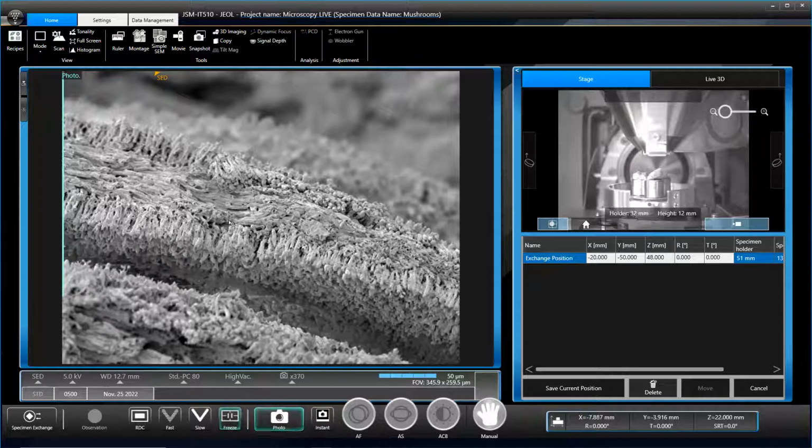And somehow this is not triggering my fight or flight response that I had with the leaves. Don't mind this one. No, this is fine. Not too bad. It just looks more like a carpet than anything. It looks soft and fluffy, organic, isn't it? I wonder how different it'll look to oyster mushrooms. I'll find out. We can have a go.